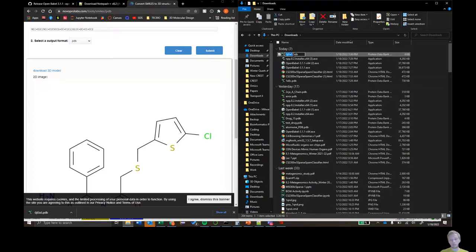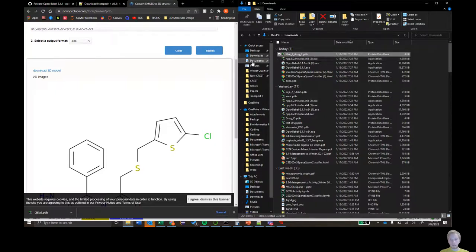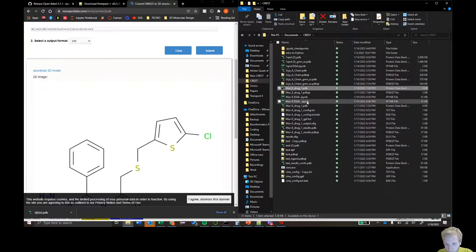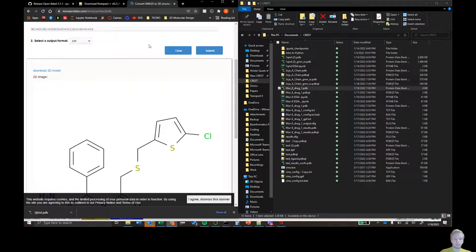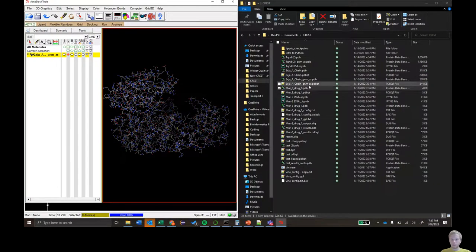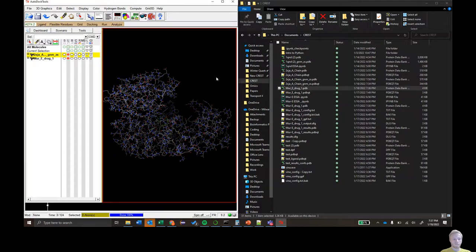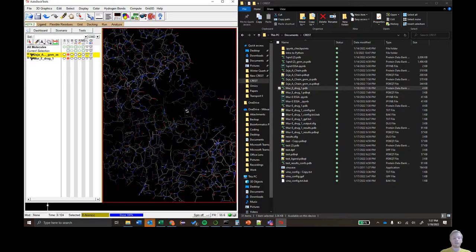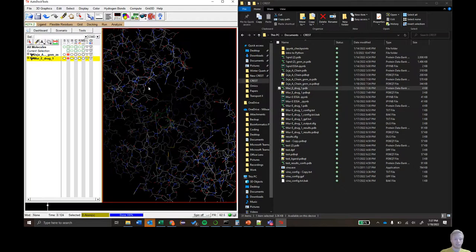Click F2 to rename it — name it something like 'Mur_E_drug' and paste it into your Crest folder. Take your ligand and click and drag it over to AutoDock Tools. You should see it appear as a green structure in the center. It may be in a different spot depending on your drug, but the important thing is you see it listed in the column here.